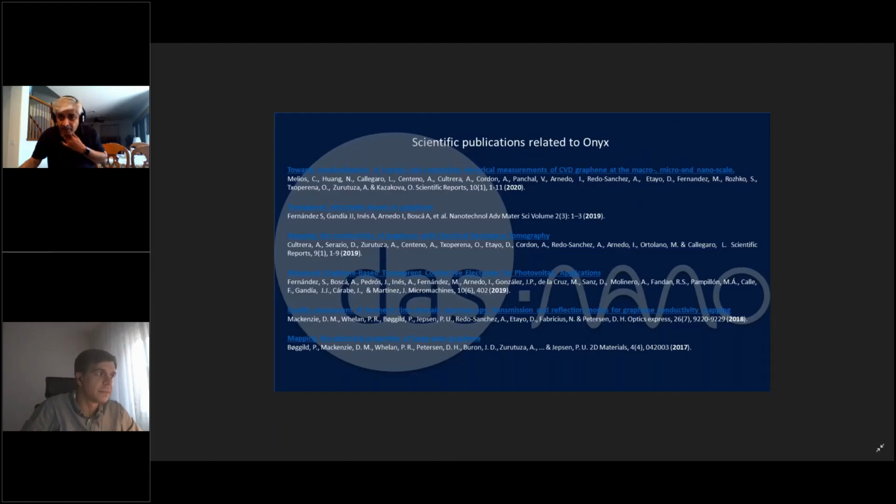There is a question here, hold on. Yeah, first question appears. Okay, let me see. What is the maximum size of the samples that can be characterized? Can you accommodate wafers more than 8 inches?